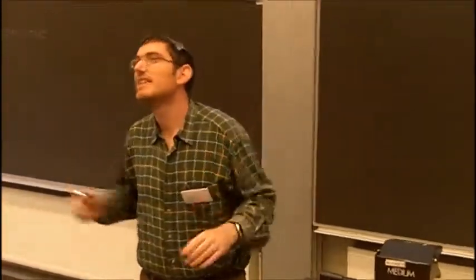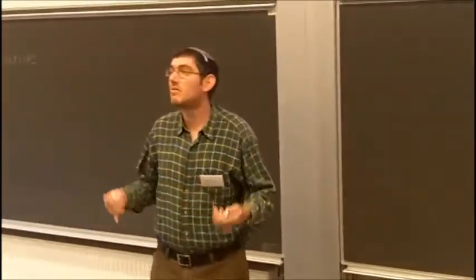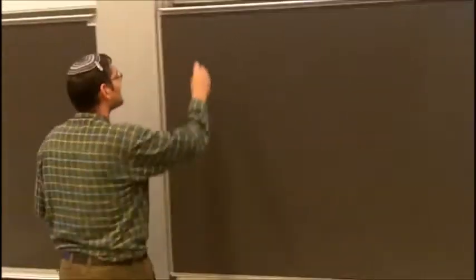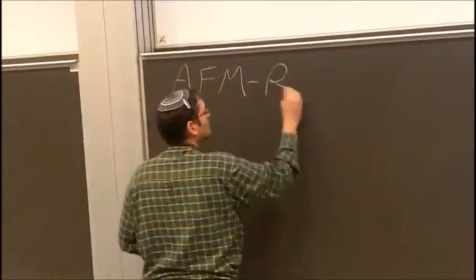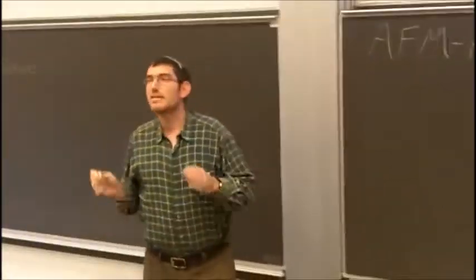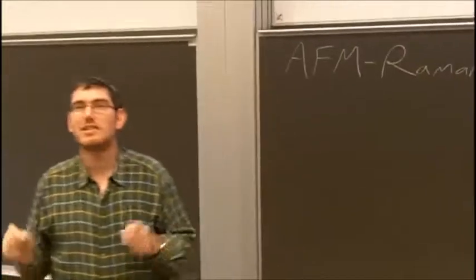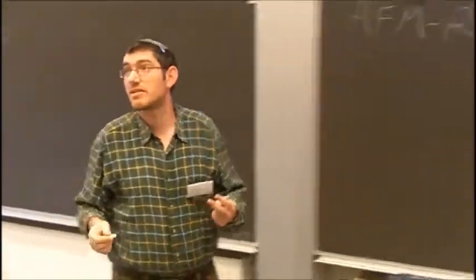Now, before I continue with this, I just want to see if some of the data which I talked about yesterday got some clarity. This also has to do with integrating what we're talking about in the seminar about Raman, so AFM with Raman. Just AFM, not TERS, not NSOM, AFM with Raman has two advantages.